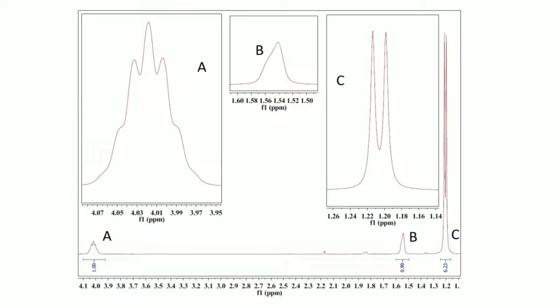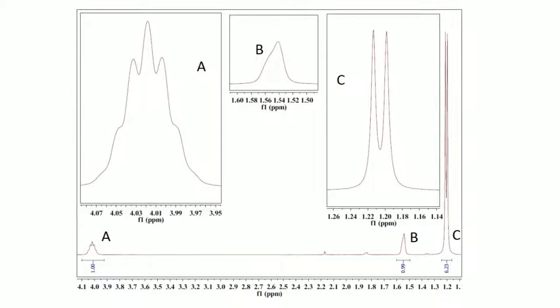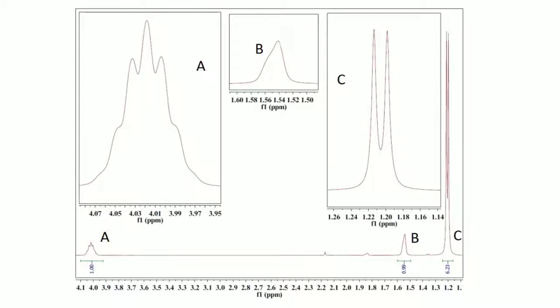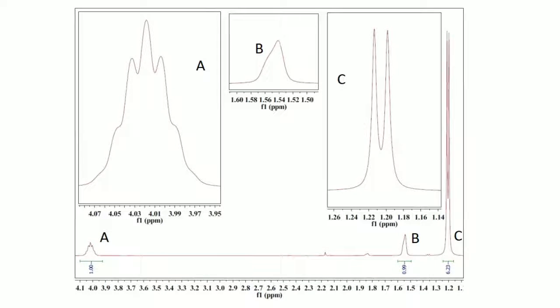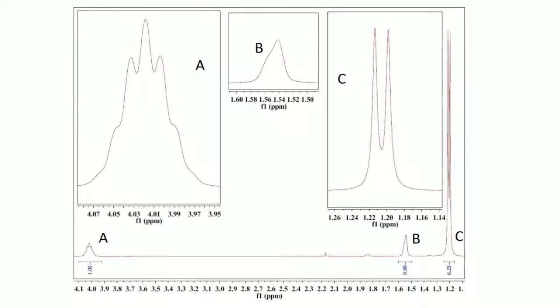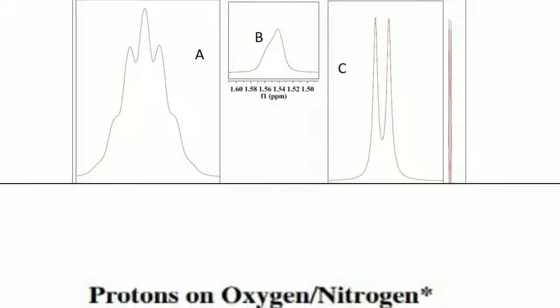In the NMR spectrum, since the integration numbers of peaks A, B, and C total 8, we determined that 8 hydrogens were in the molecule. With both signals A and B, the integration number is 1. Therefore, we concluded that these hydrogens were either part of a CH or OH bond, whereas signal C with the integration number of 6 would likely be signaling 2 CH3 groups.